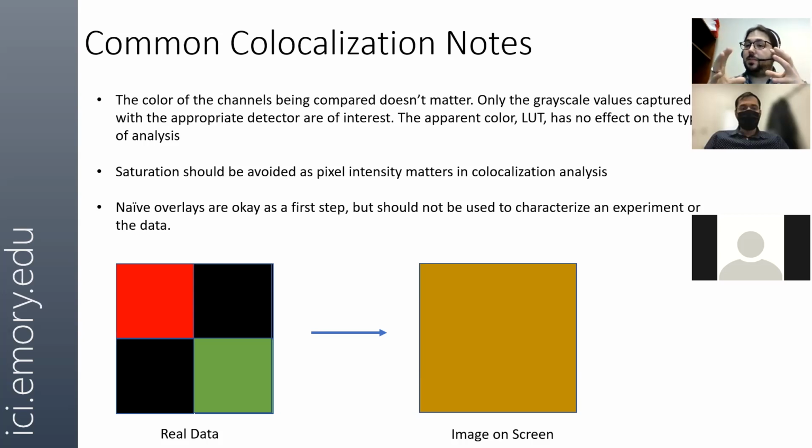So we'll take an average of the colors there, that's what we'll project. So the kind of overlap that could indicate co-localization is at once also subject to the medium through which you're seeing it. If you're looking at it on a computer screen, it could seem like there's co-localization when in fact the pixels are not on top of each other and would not show up as co-localized.